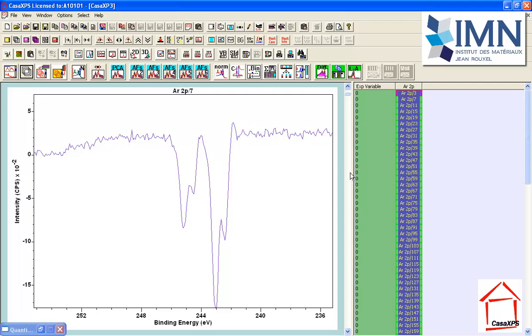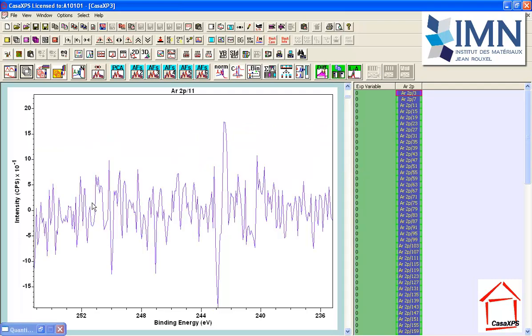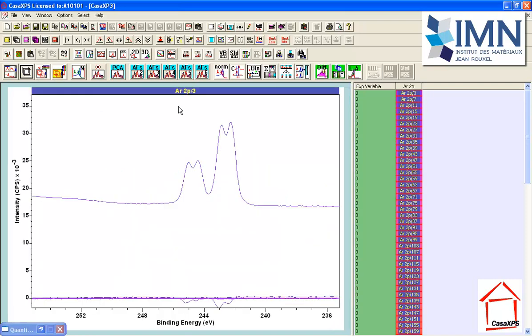If we go to the next PCA abstract factor, well, that's very much looking like the residual, in other words, noise. So on that basis, I believe that there are two abstract factors, the average spectrum and the deviation from the average spectrum, that we can use to reproduce all the data, and in doing so we can remove some of the noise.